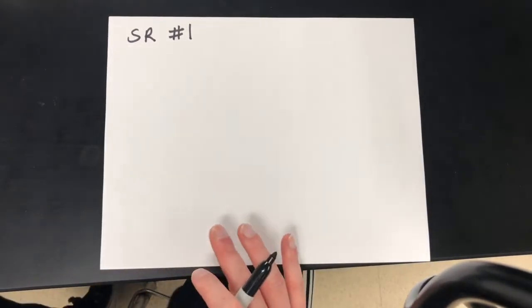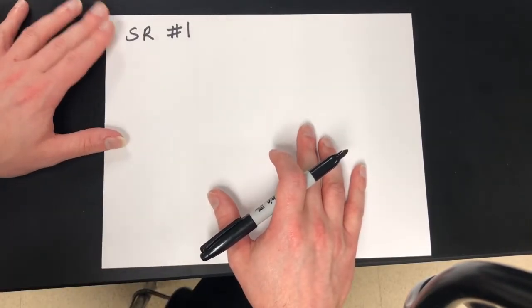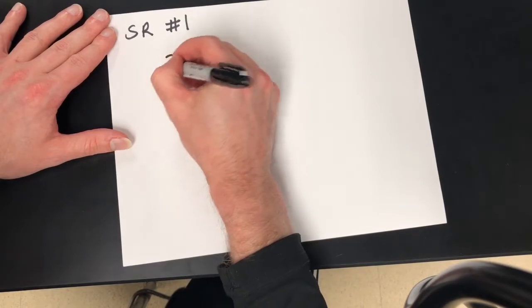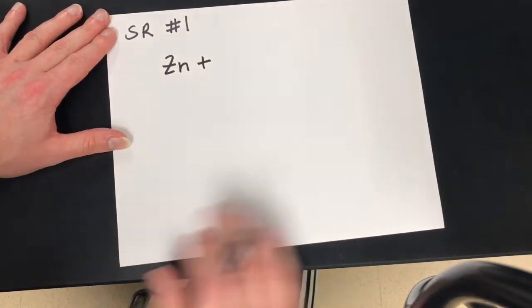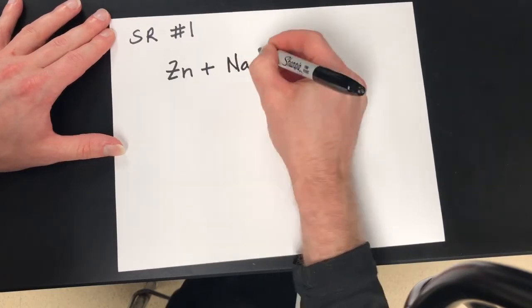Okay guys, so this is single replacement reactions. We're going to use our knowledge of what we've learned in class using the activity series to complete these 10 reactions, and we're going to actually see what happens or predict if nothing happens. So you're going to need your activity series chart. Our first reaction is zinc plus sodium chloride. Zinc is Zn, sodium chloride is NaCl.